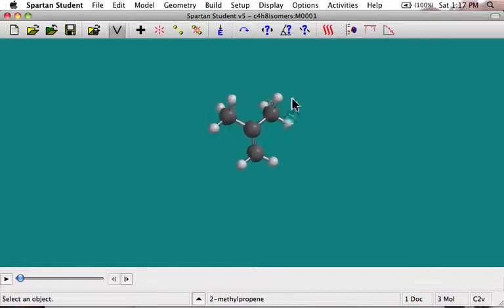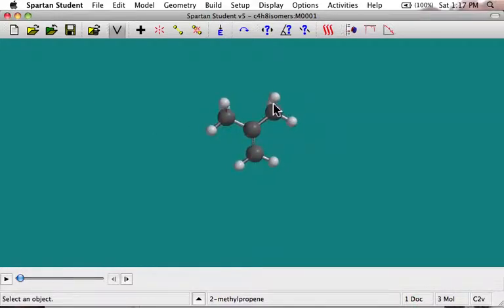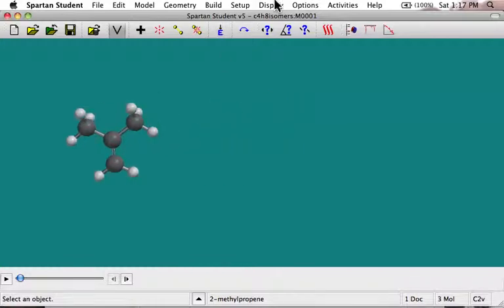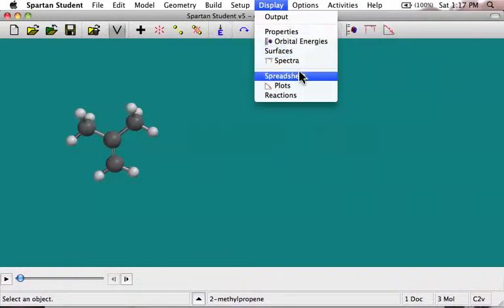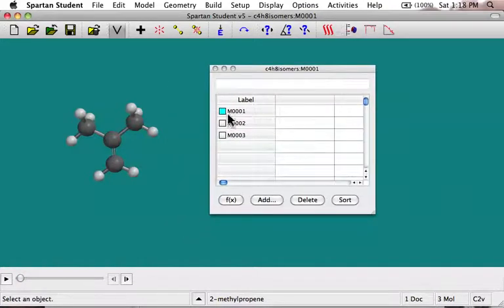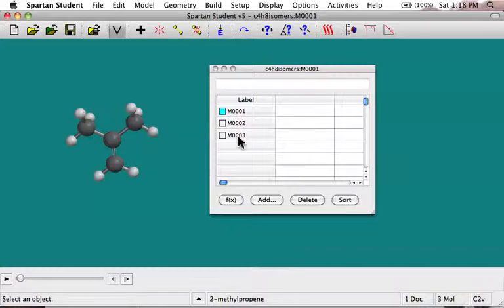Even more useful is I can look at their relative energies in a spreadsheet. So I'm going to go Display, Spreadsheet. When I display the spreadsheet, it brings up these three molecules indicated as molecule one, two, and three, and I can even label them. So I can say, oh, that's the 1-1 isomer.